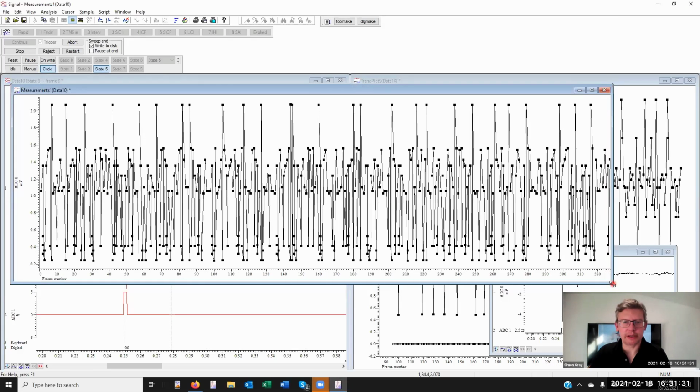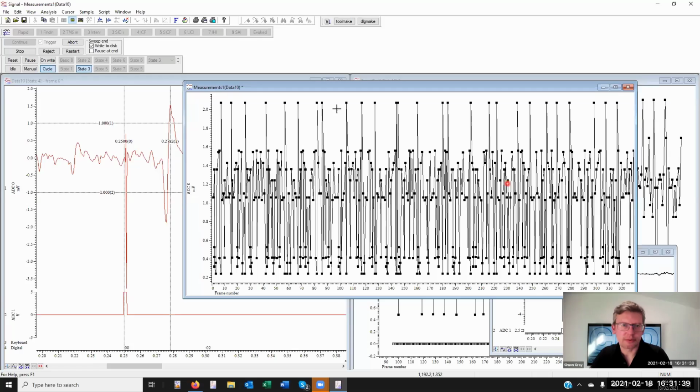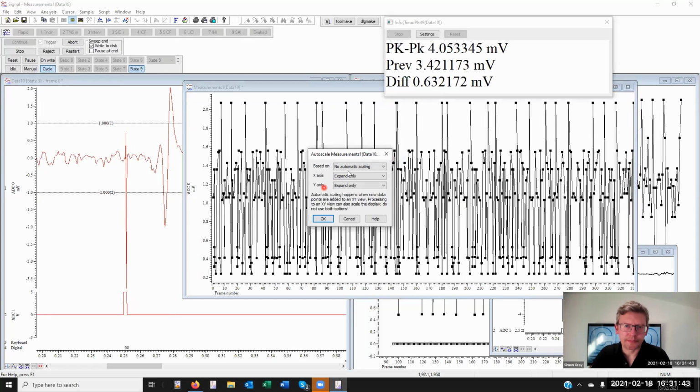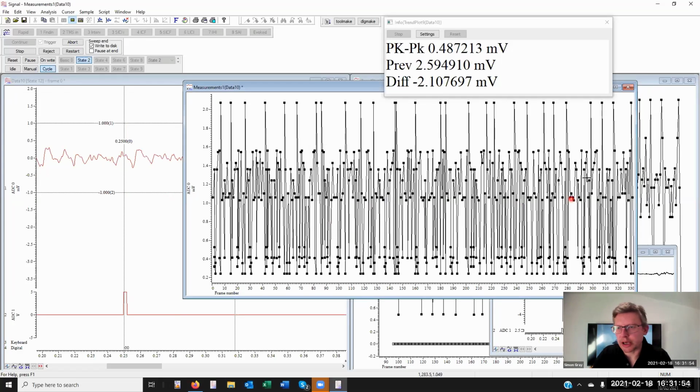Working through a lot of data there. So once again, it's gone through to the beginning of the file, and if we can, yes, I'm going to stop the automatic scaling, and just switch all of these off so I can show you what's happening.